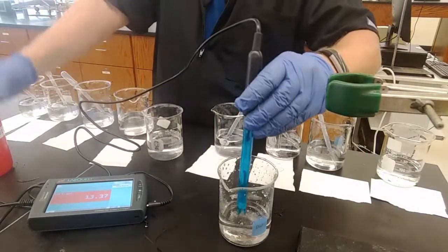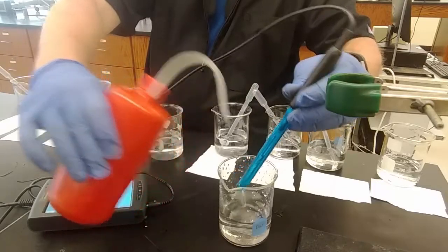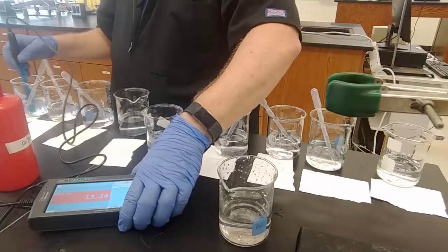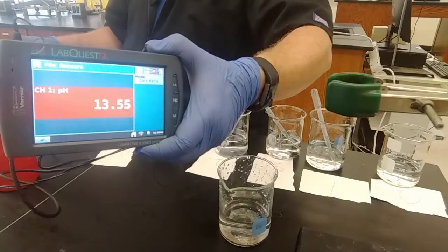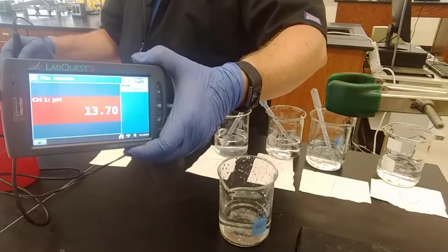Final rinse. Final test with the meter. Expecting 14. It was 1 molar base. It's definitely higher than 13.33 right off the bat. Will it get to 14? It's kind of the limit of the meter.